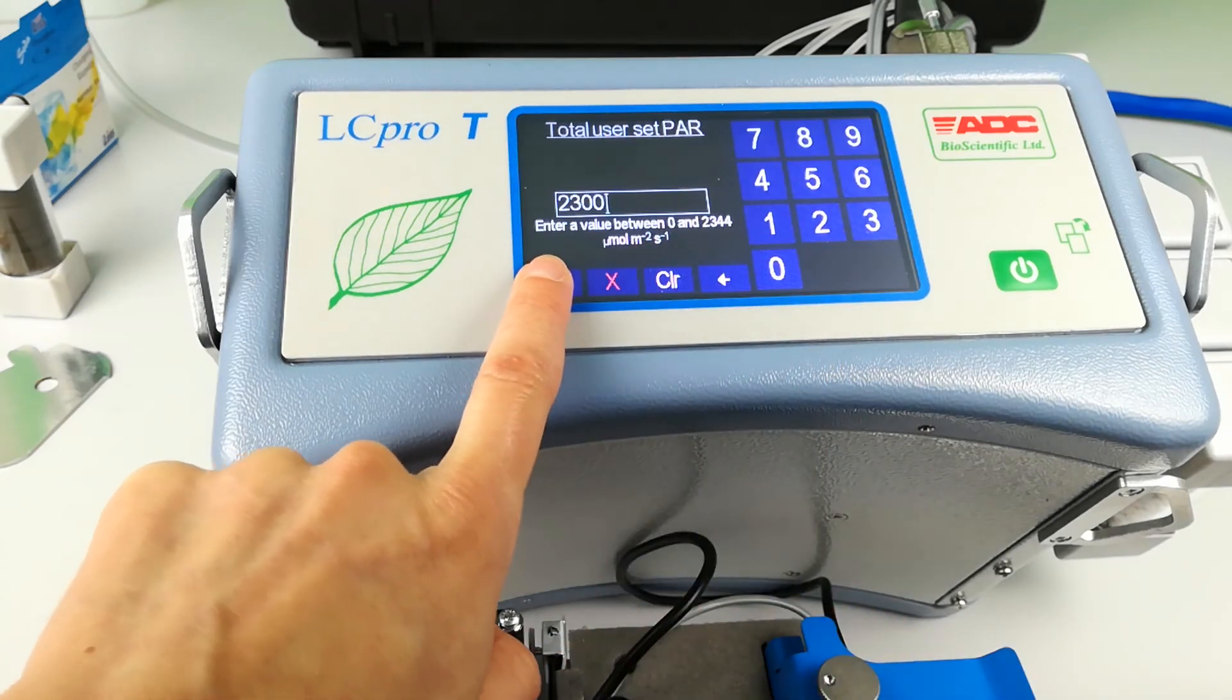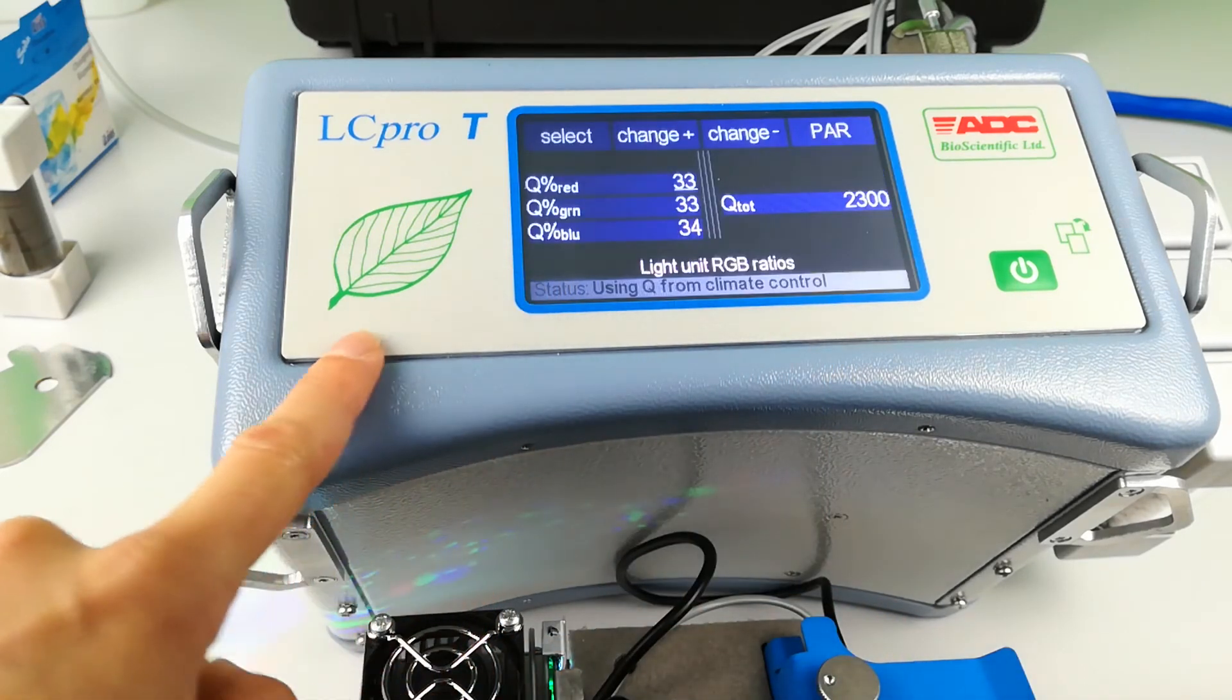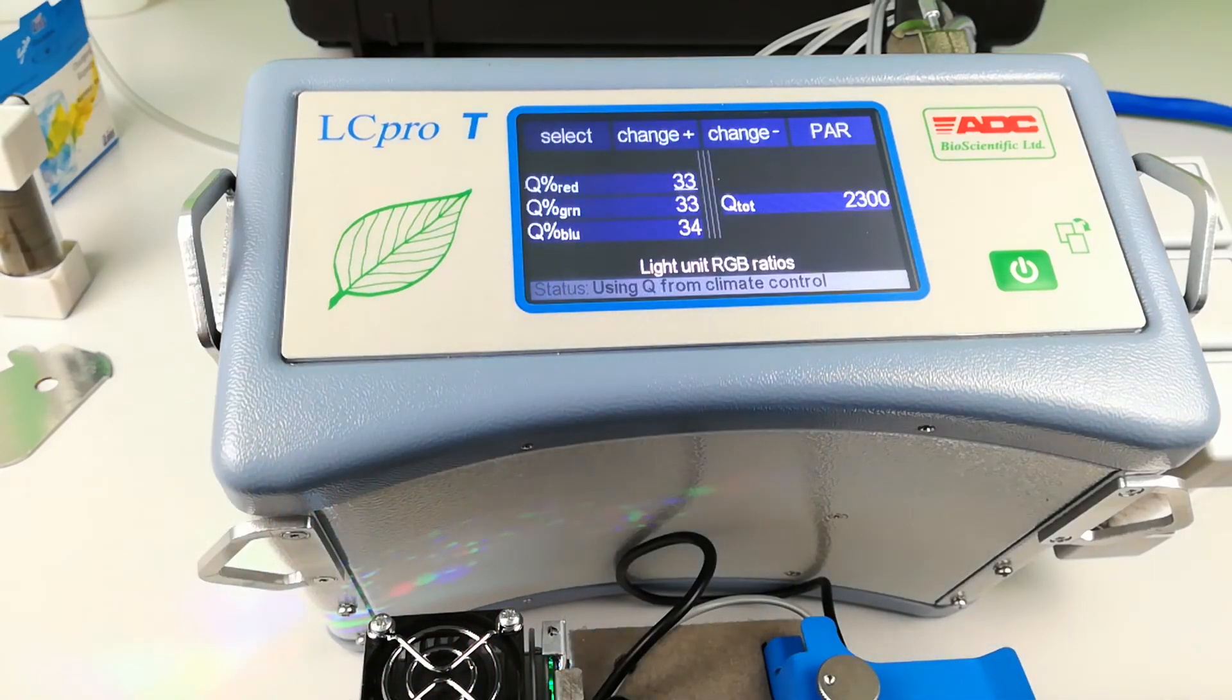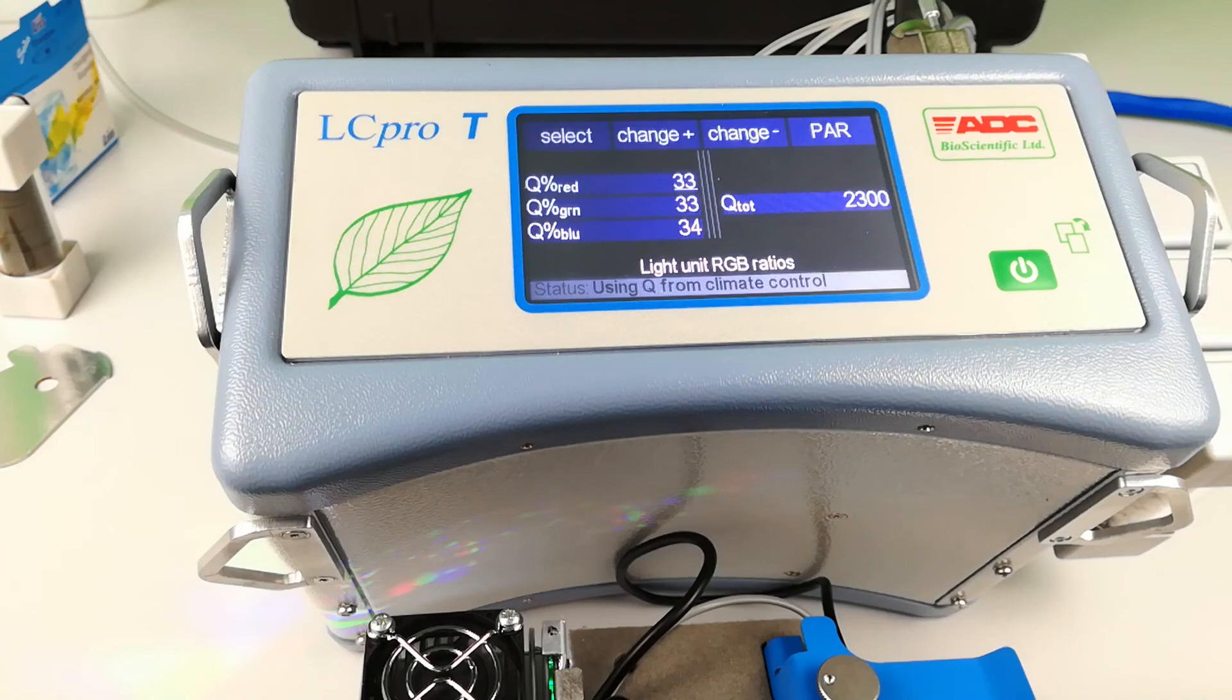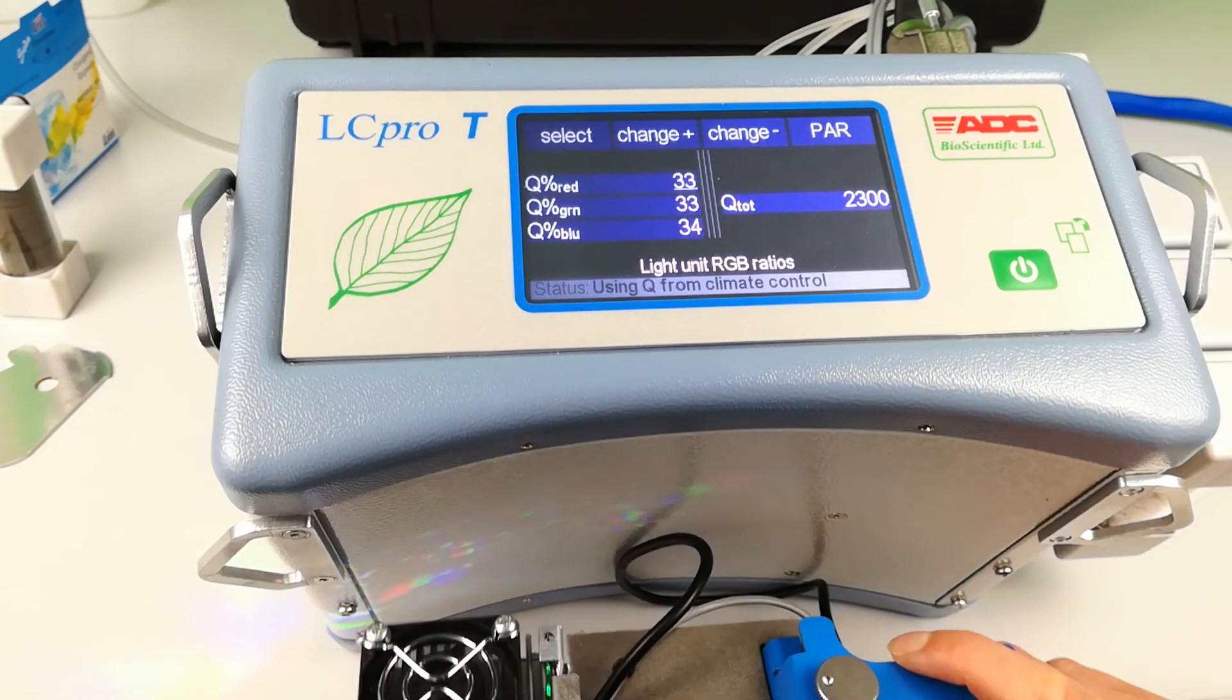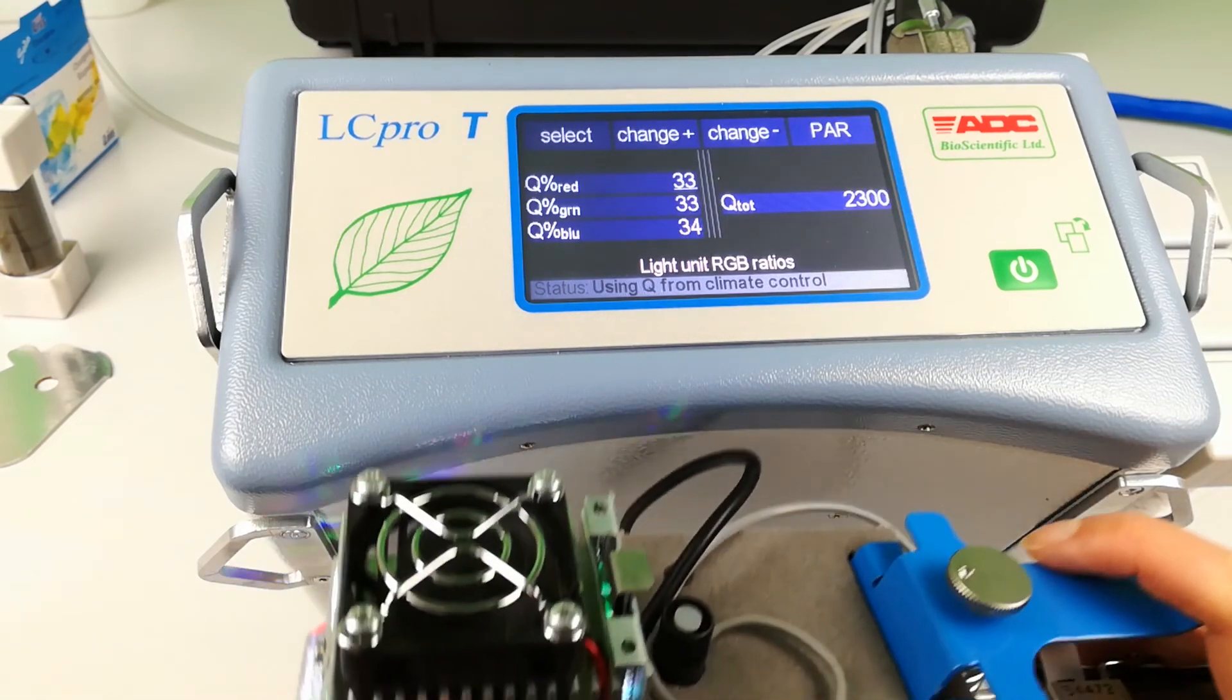Now the total range available is 2344 micromole. With the total value set, you can check that the RGB light unit is operating within the chamber.